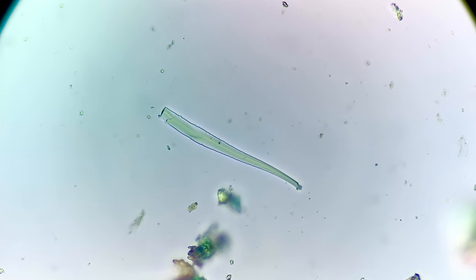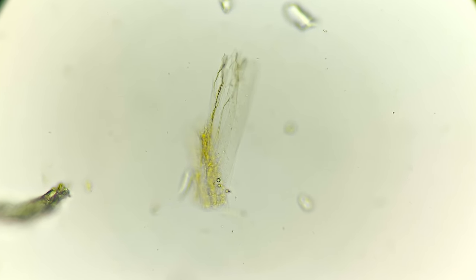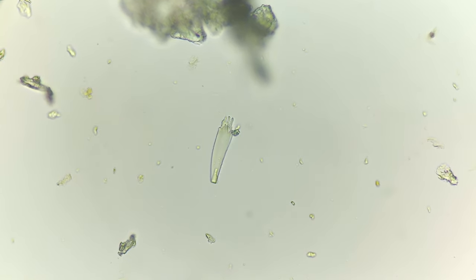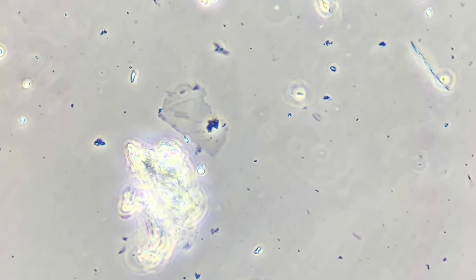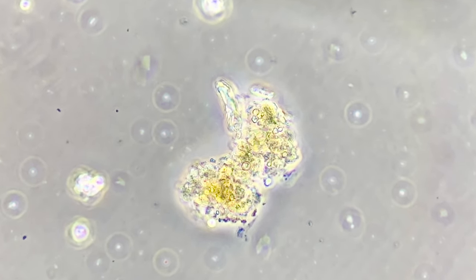It's very likely that there would have been bacteria in this sample and would have consumed some of the plant matter in this sample, and it might have produced some biofilms. And I think that's what we can kind of see here: the husk of old plant material and biofilms. I couldn't see any moving life.